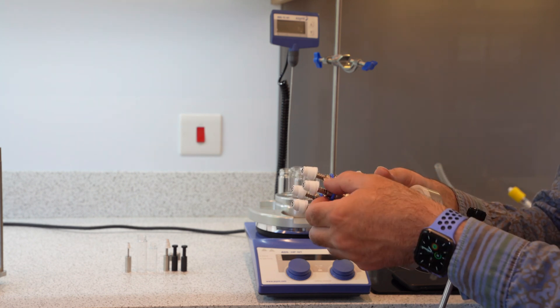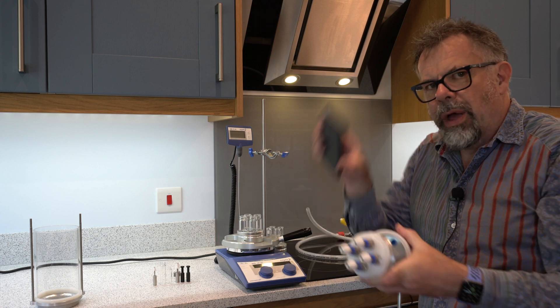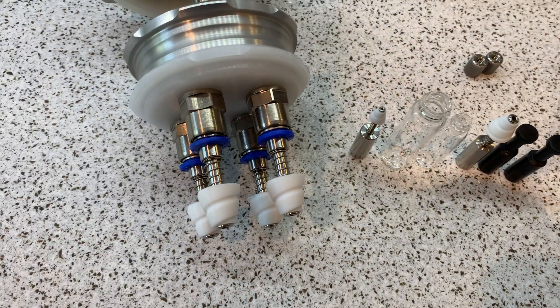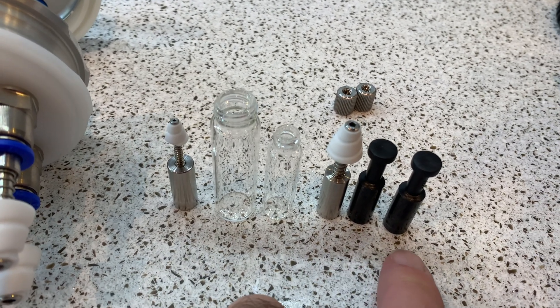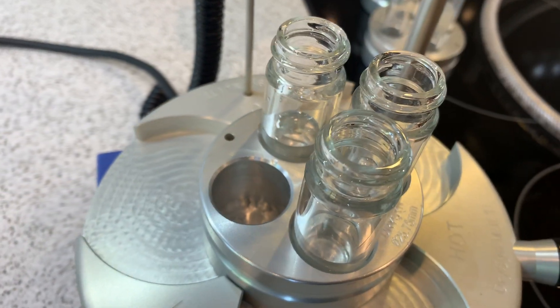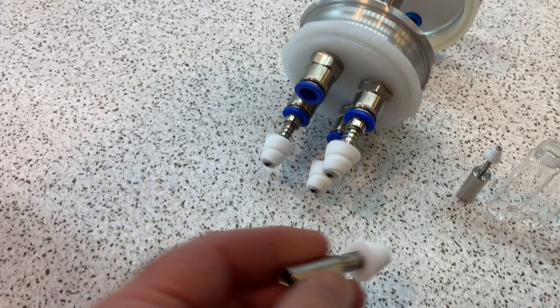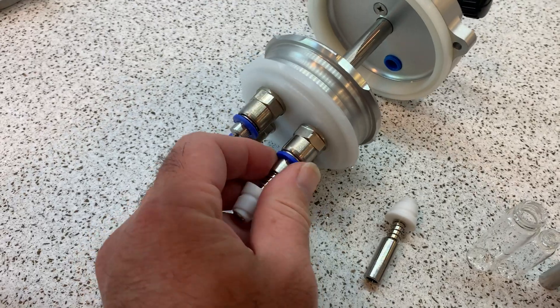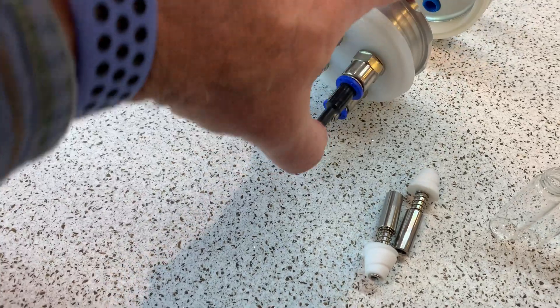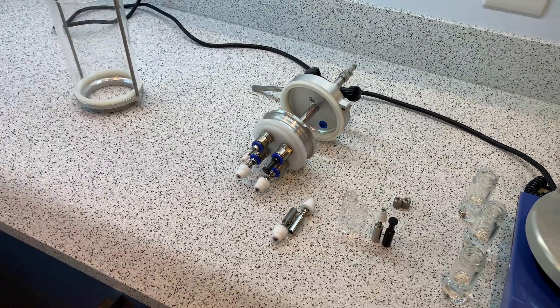Each of the plugs is held in by one of these 10mm push-fit fittings that seals, with a simple collar to release. Here we have four plugs of one size in place, smaller plug options, and also blanking plugs in case you only have three tubes, two tubes, or even one tube. To change a plug, with one hand you push the blue collar and pull at the same time — that's how simple they are to remove. To put others in, you just push and they're held in. Very easy to use, no moving parts, nothing really to go wrong.